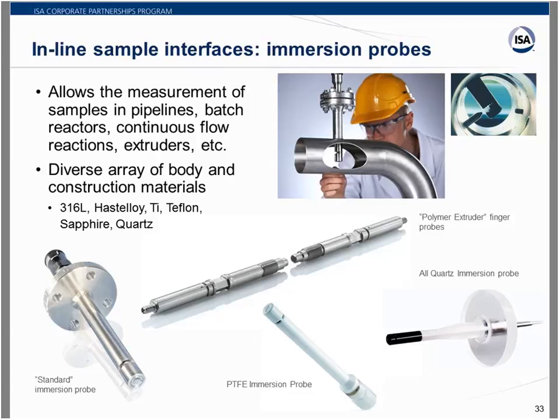We also have shown an all-quartz probe where not only is the probe made out of quartz, but the entire flange is also made out of quartz. And this was created for something where absolutely no metal whatsoever could be in the process. So this was a very specialized thing, but it shows some of the versatility of what an immersion probe can be.